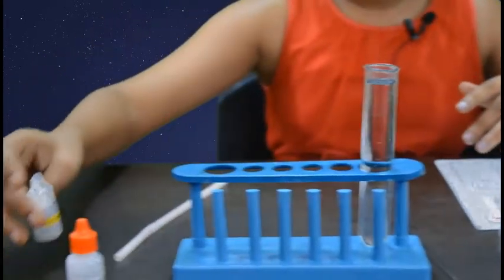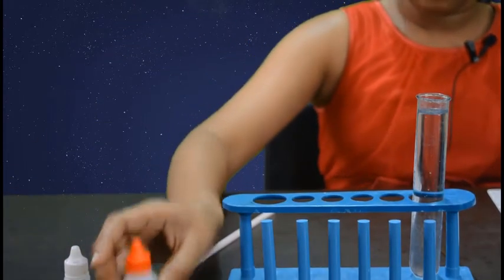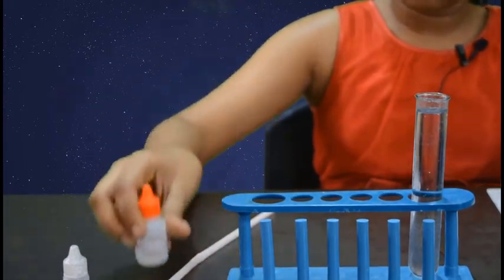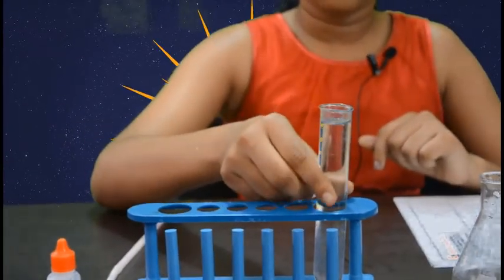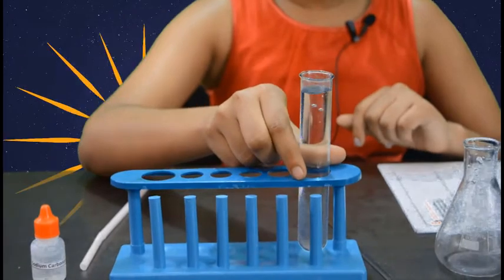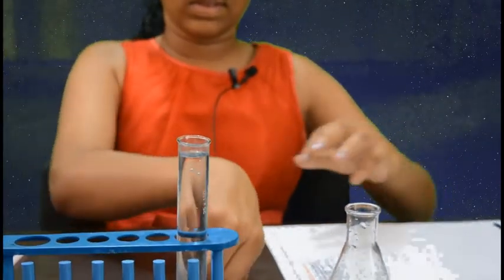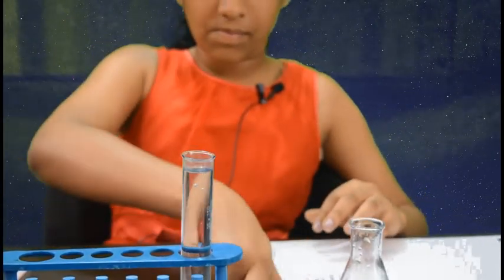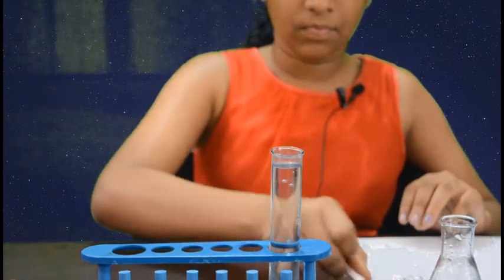The materials are: phenophthalein pH indicator, sodium carbonate which is also known as washing soda, test tube holder and test tube which can hold 50 ml of water, conical flask, stirrer and a blower. Now let's begin with the experiment.